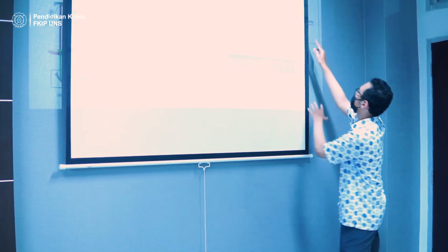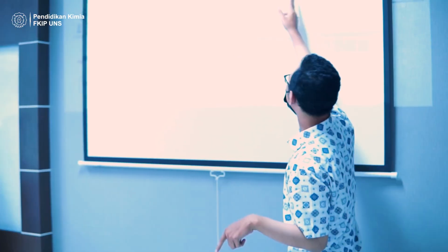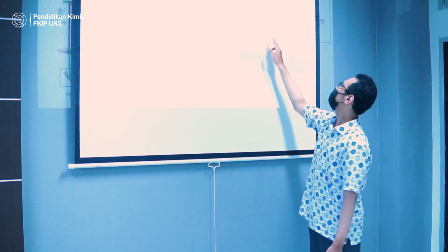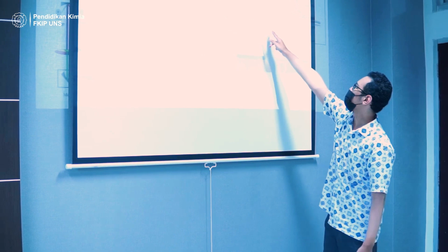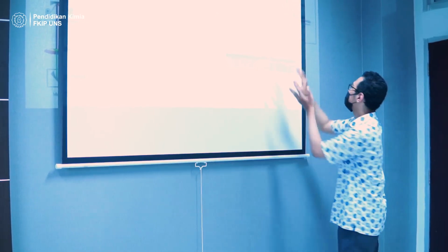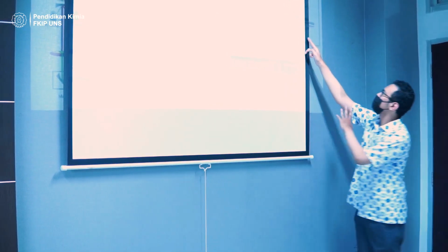As the color progresses, a longer wavelength gives the maximum absorbance. For pH 4 and 5, it will be around 550, and so on, until the last one, pH 12, at 660.